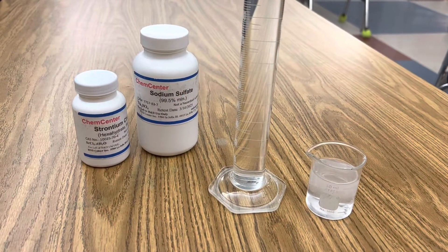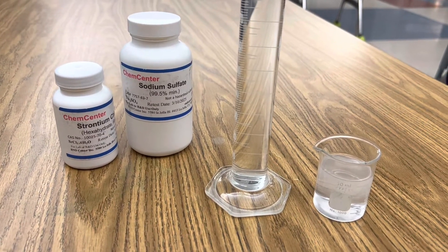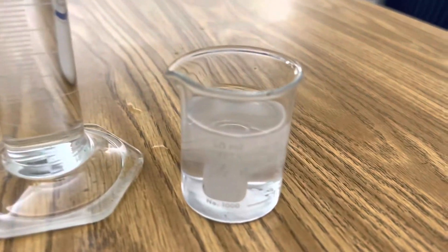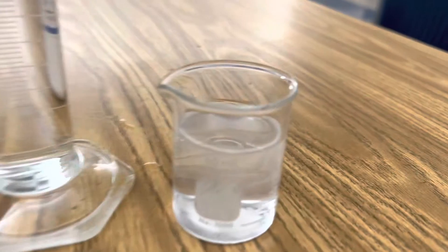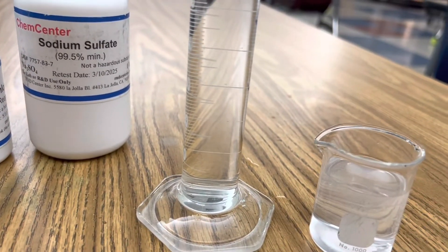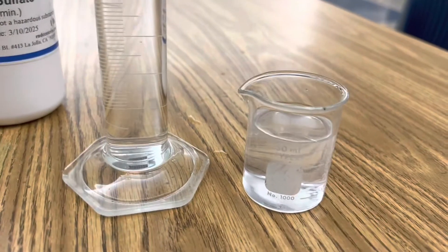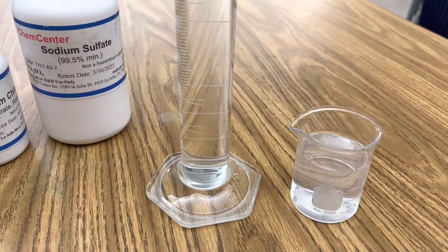Now you're ready to combine both solutions. This is a double displacement reaction where your sodium sulfate when you combine it with your strontium chloride will become sodium chloride or salt water and the strontium chloride will trade places and become strontium sulfate in a delayed precipitation reaction. Let's check it out.